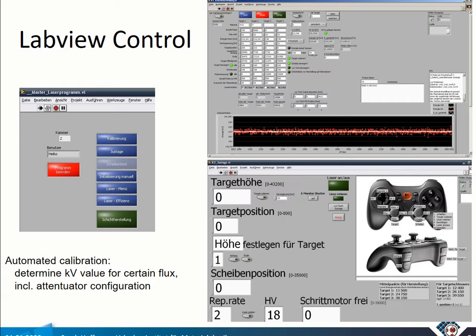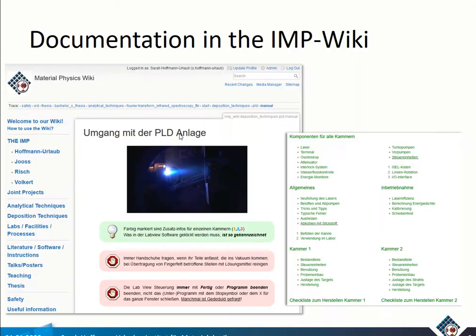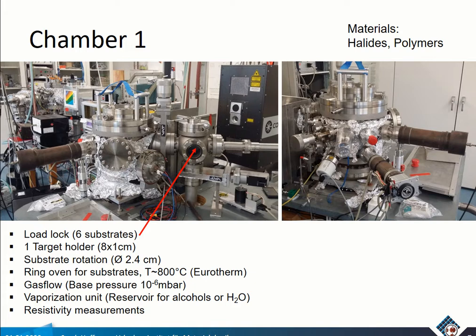This is recorded and stored during each process. Yeah, this whole setup is a little complicated, but everything I know about this setup is stored in the wiki of the institute. Again, in German still, but I'm working on having that in English. So now I'm going to talk about the different chambers.